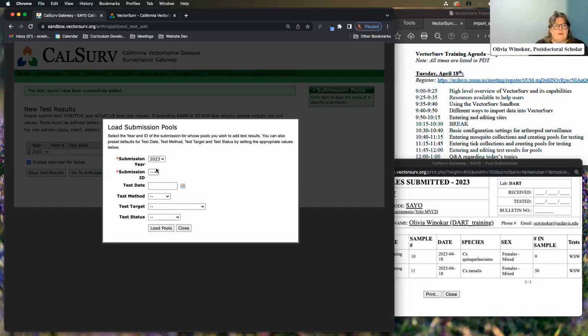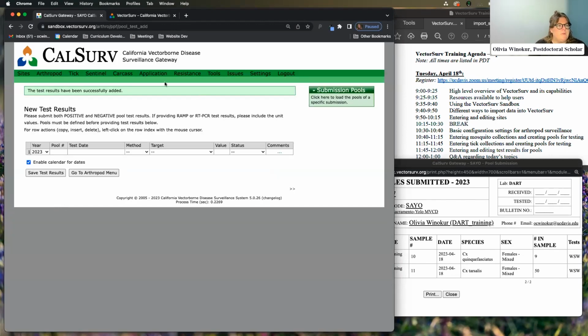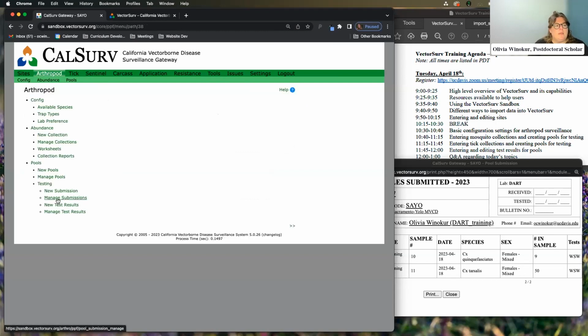You'll notice here that I guess we can still load those, but maybe it hasn't updated yet. Test results have been successfully added. With everything else, we can also manage our test results here.